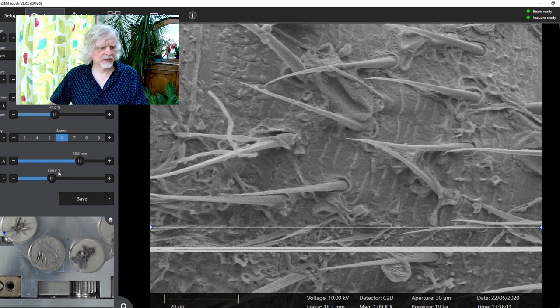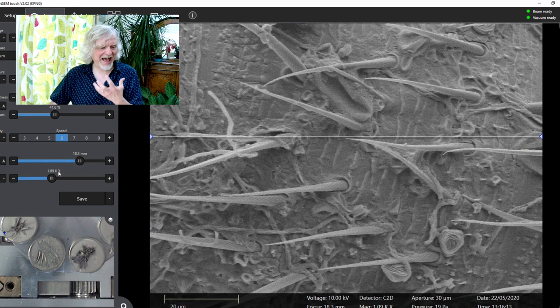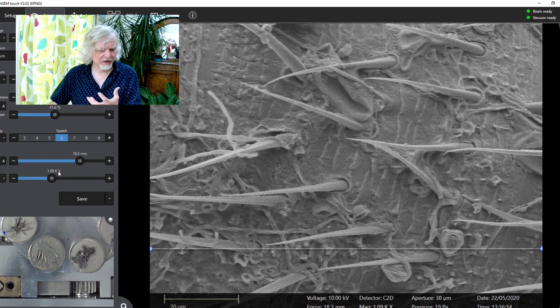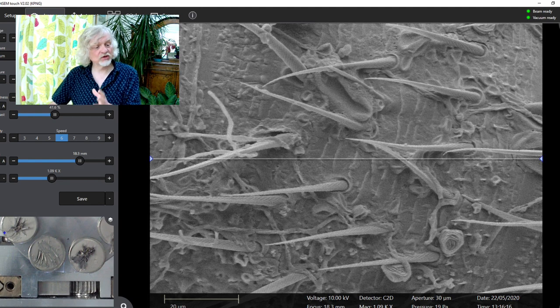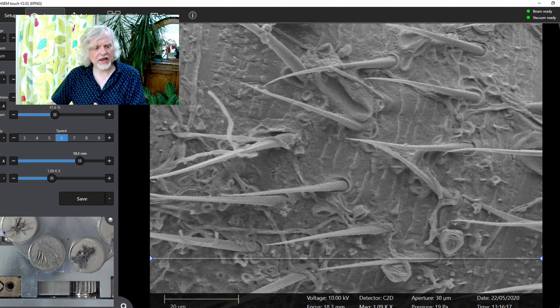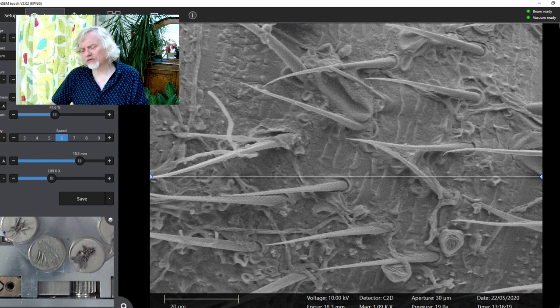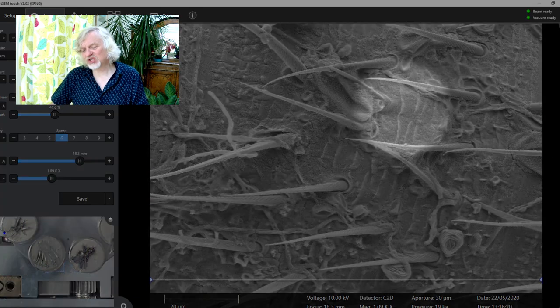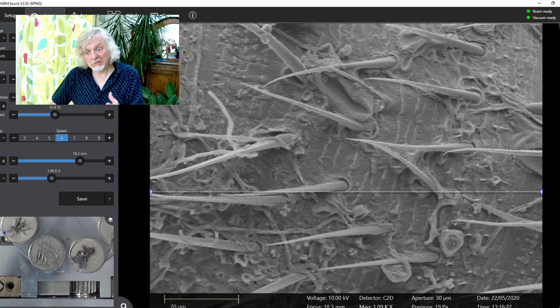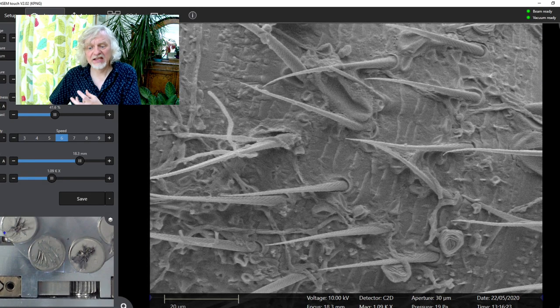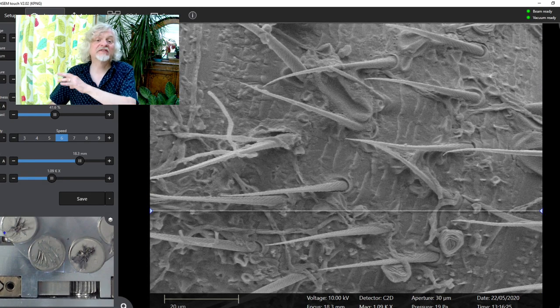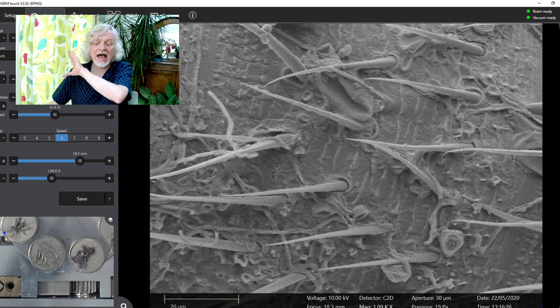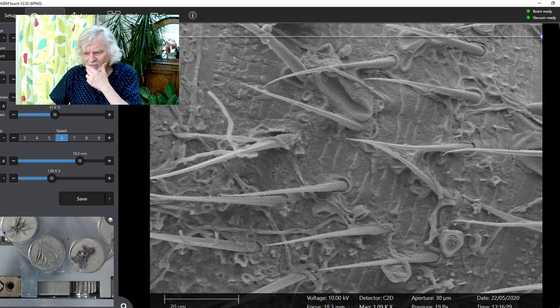We're getting really close. And now we're starting to see the individual hairs. Now, there are lots and lots of things going on here. So obviously, this is the skin of the antenna, the surface, which is made of chitin. It's layers and layers of chitin. It's the exoskeleton of the creature. And then sticking out are these hairs here.